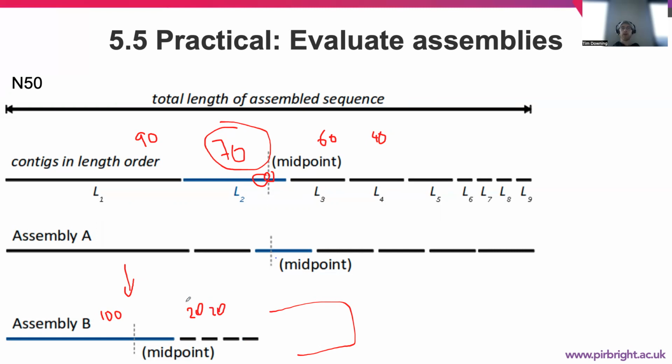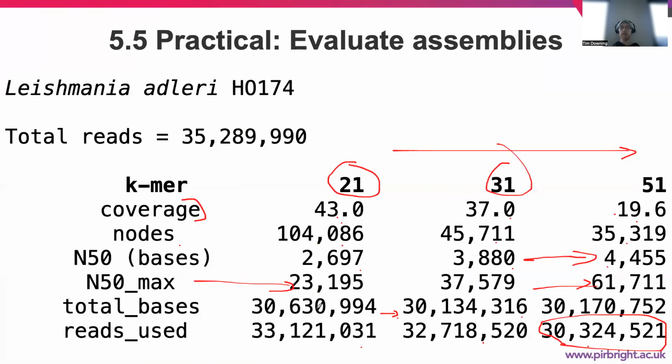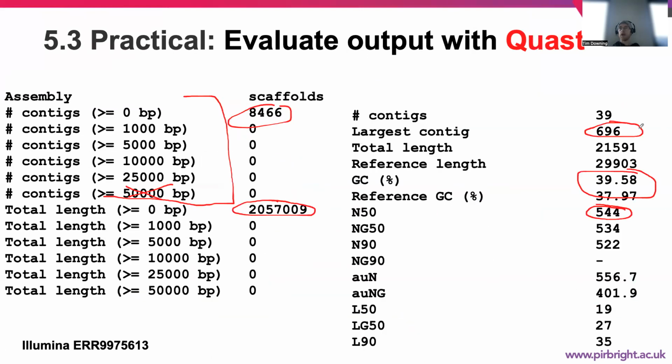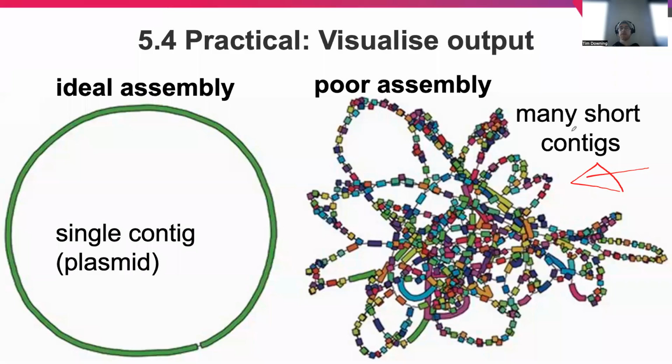So we also need to look at the total span, which you saw earlier, the total bases, to see if that's consistent. And we had other examples here where the total length, if that's out of sync with the reference, like this example here, is an indication that this assembly is not very good. And we shouldn't be really trying to, the N50 stat might be biased.